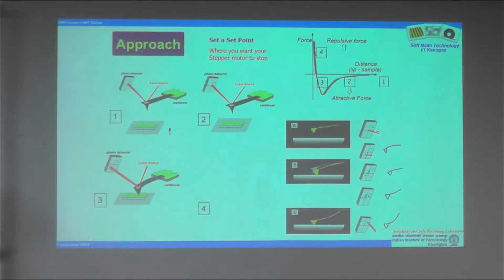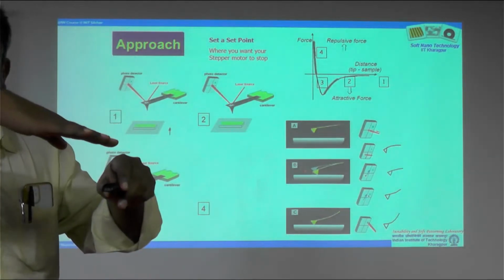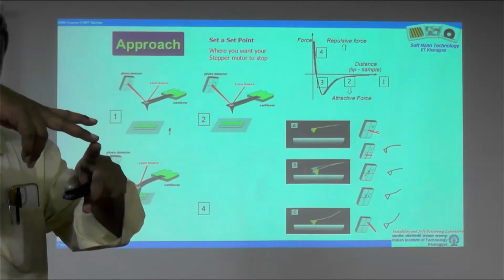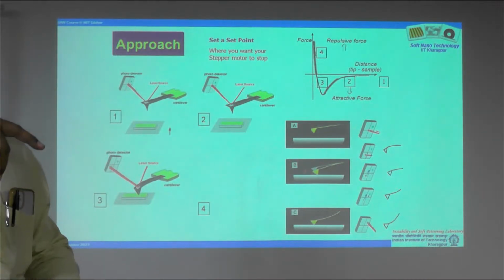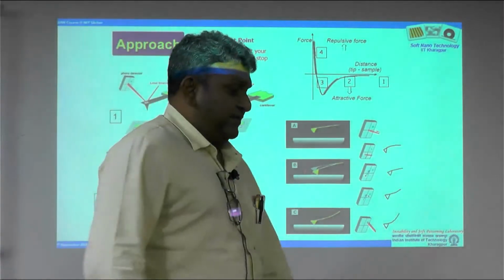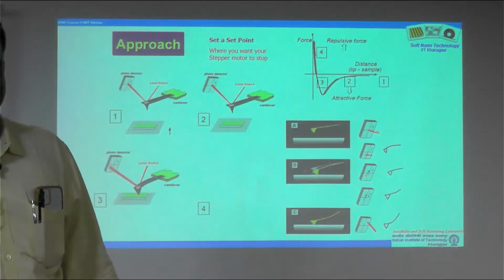Because of the motor, the tip and the surface would have come to contact anyway, right? But just ahead of contact, the tip is experiencing an additional force and it stoops, and therefore comes to contact earlier. I'll give you a very silly example. In India, we have the culture of touching somebody's feet, right? So what do you have to do?